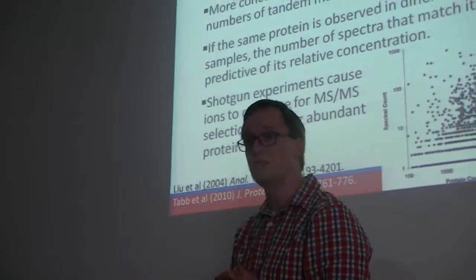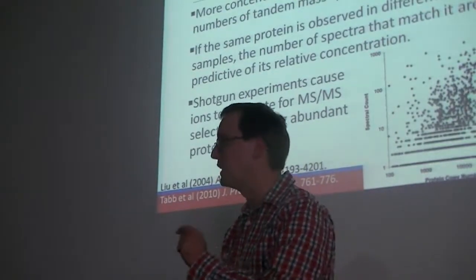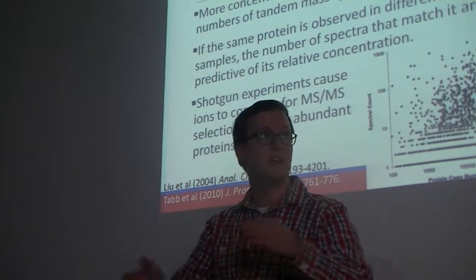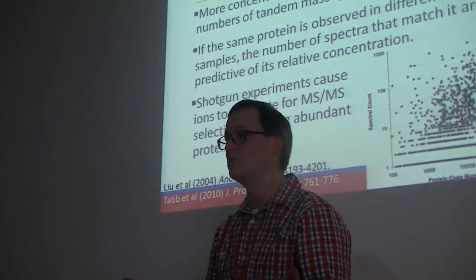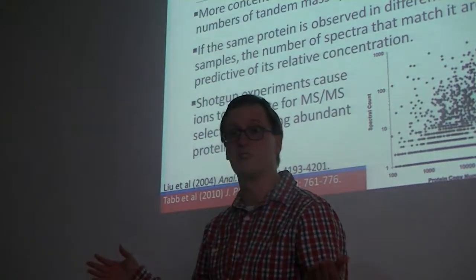And one of the things that we discovered was that spectral counting is a method that's relatively hard to screw up. The people who use spectral counting tended to do better in deciding which proteins are differential between cohorts because the software is not complex. You just have this table, essentially.